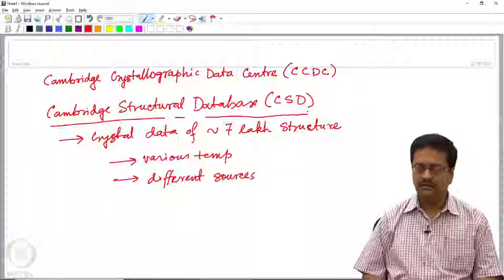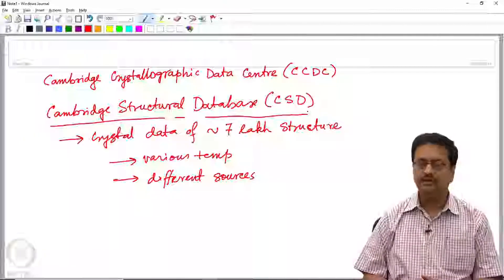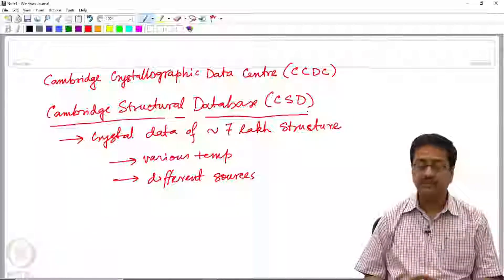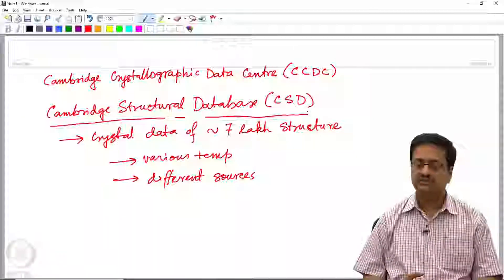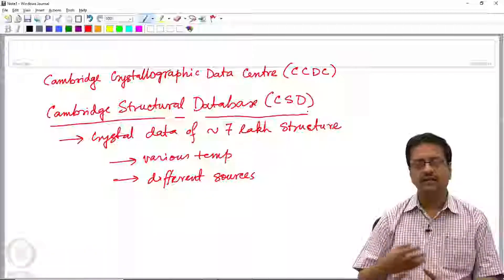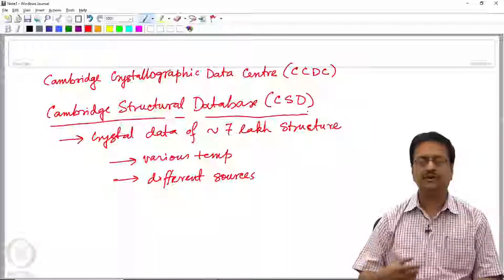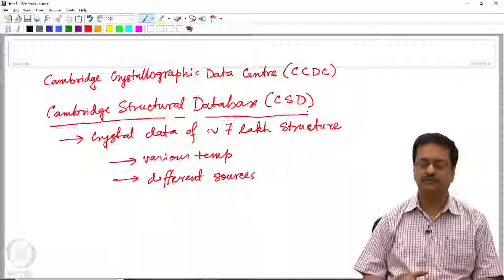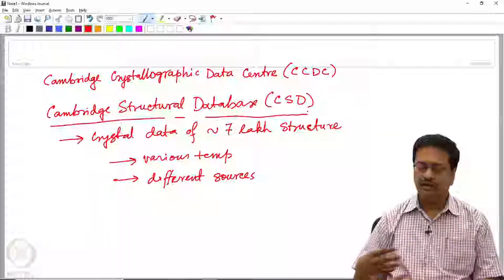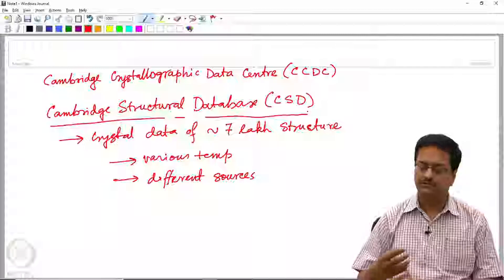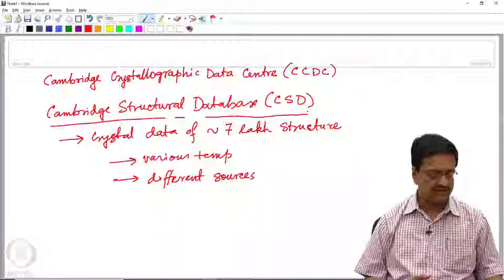In the next 20 to 25 minutes, let us see how one can utilize the Cambridge Structural Database for different purposes. It is not only used for searching crystal structures — it is also used for identifying structures having particular types of intermolecular interactions, inter-ionic interactions, and so on. I will demonstrate some of those using our licensed version of the Cambridge Structural Database.